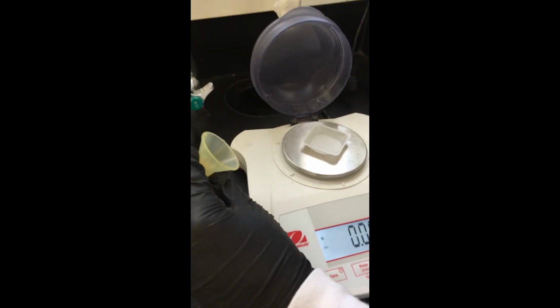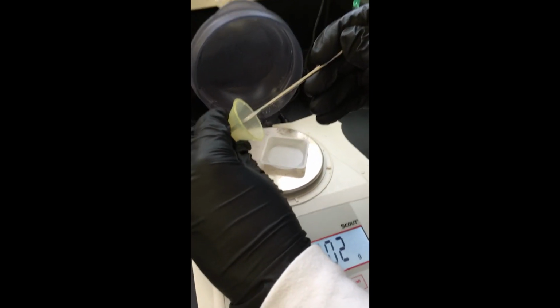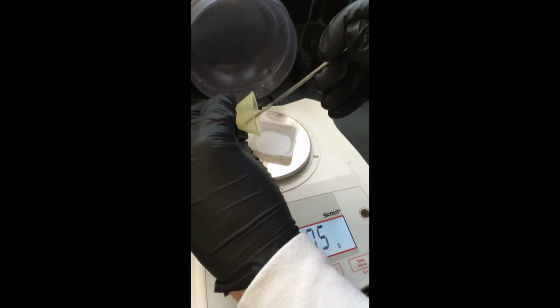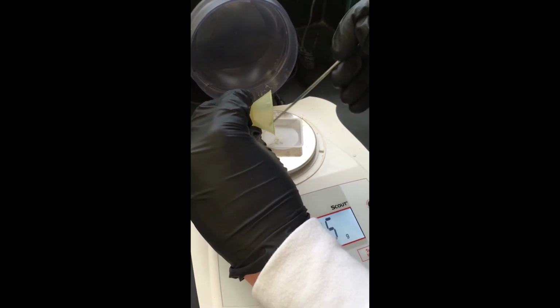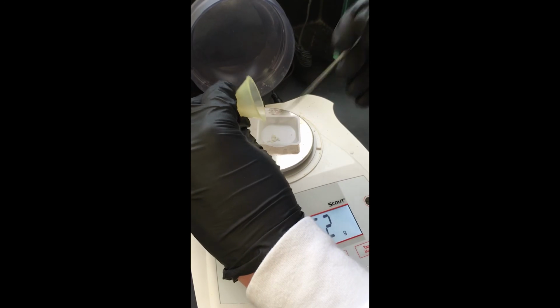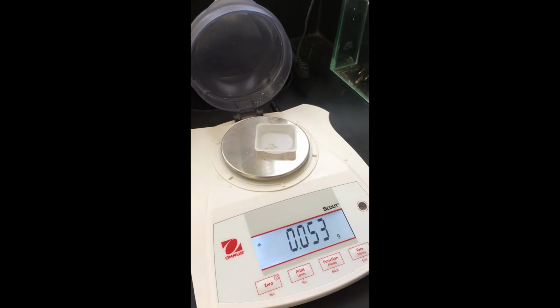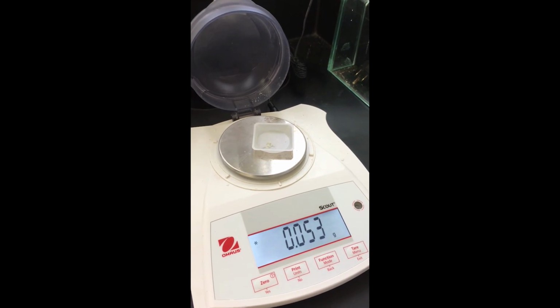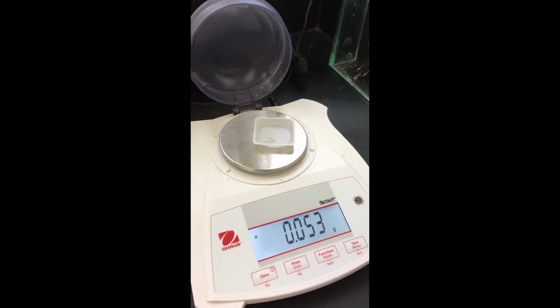Alright, so now that the crystals have finished drying on the vacuum filter, I'm just going to go ahead and weigh them. So I'm just going to scrape these out of the funnel and onto this weigh boat. As you can see, we've got about 53 milligrams of the product.